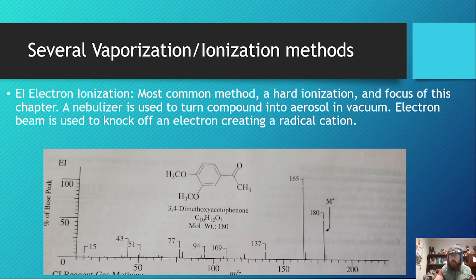And so there's some that we won't talk about now, called the McLafferty rearrangement, where you basically form a six-membered ring in space where a hydrogen transfers from one side to the other side.